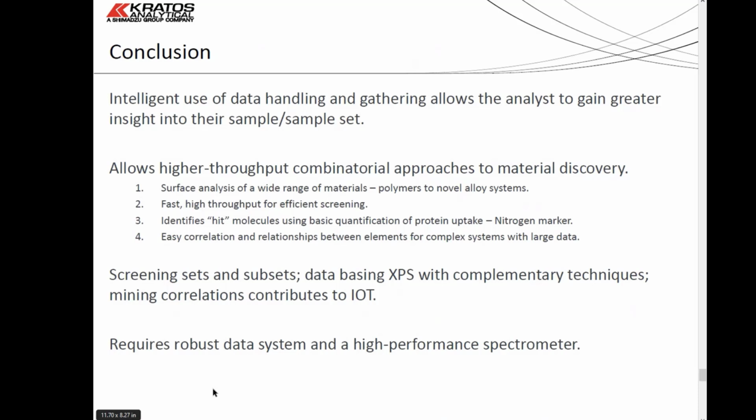That was particularly useful for the cesium stuff and for the nitinol materials. You just get to see relationships that you wouldn't pull out if you're just analyzing places. Obviously, the real benefit comes with having a high performance spectrometer. So, you're blessed with Kratos spectrometers, so you can really dig into your sample analysis and get your throughput up significantly.